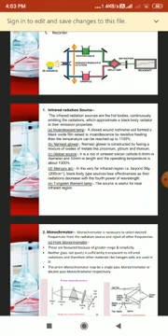The nichrome coil does not require water cooling. It requires little or no maintenance and gives long service. This source is recommended where reliability is essential. Though this source is simple and rugged, it is less intense than some other infrared radiation sources.